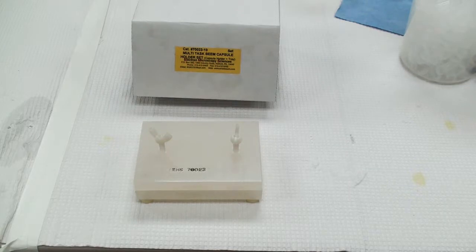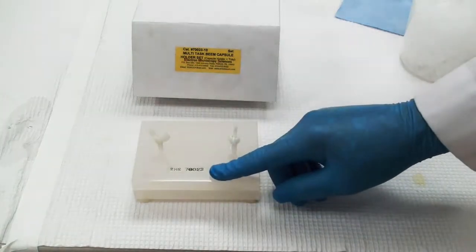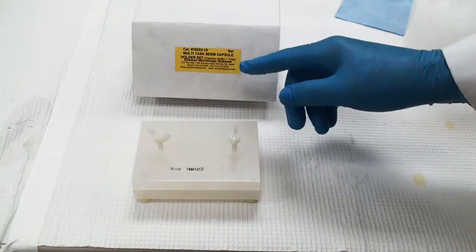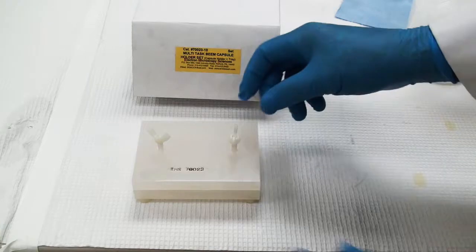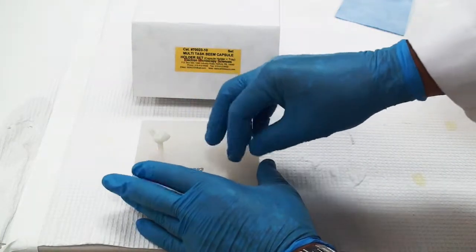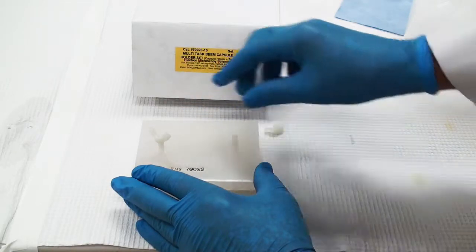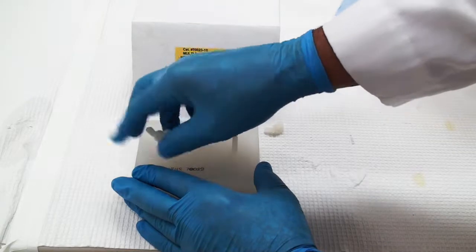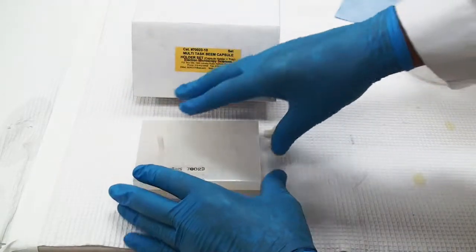To get started, we're going to take a look at the multi-task embedment for polymerization of epoxy resin. You can use it in a regular oven as well, but I use it for our rapid polymerization. In this step, we'll be able to do our full polymerization in 3 hours. We simply take the top of it off, and let's take a look at the inside of it.